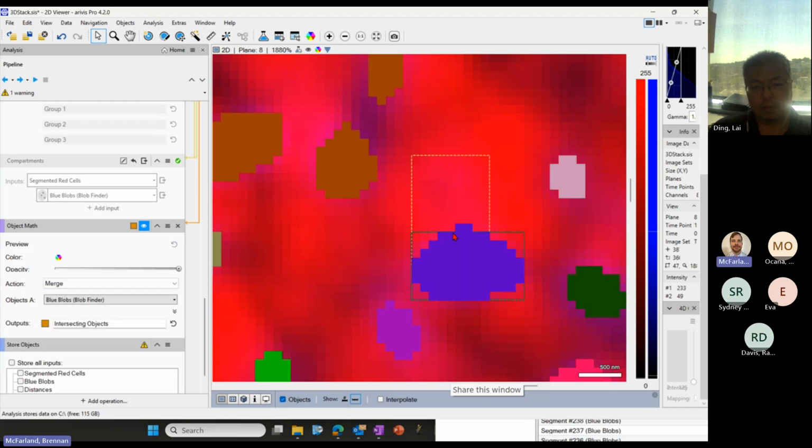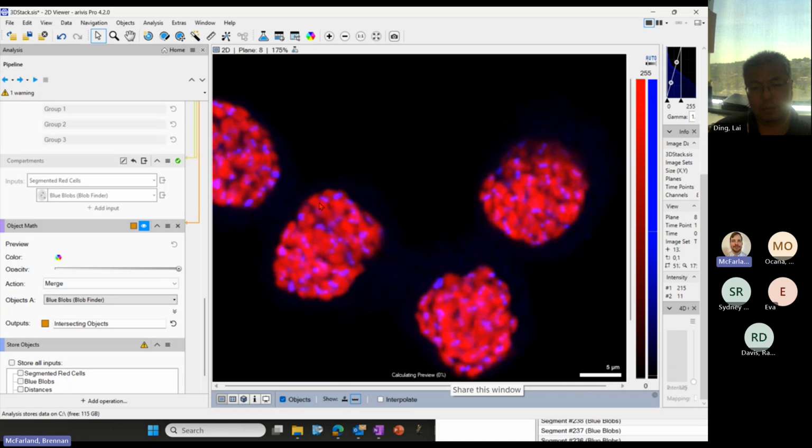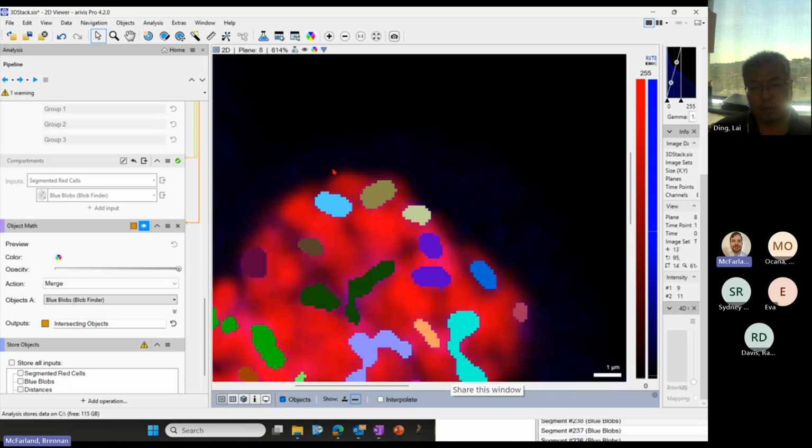And I use this sometimes, but this is more of a special case, where maybe you have really difficult immuno and you can't get the entire object of interest out with just a single operator, maybe you need to use two operators to get everything. Then you can combine the results of those and the full volume of those are going to be merged together.